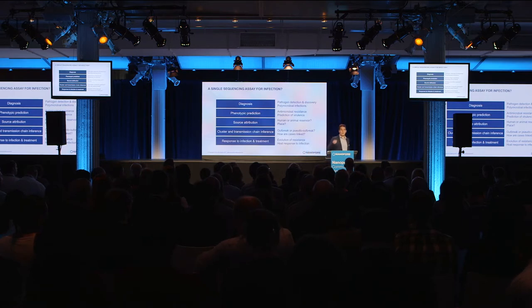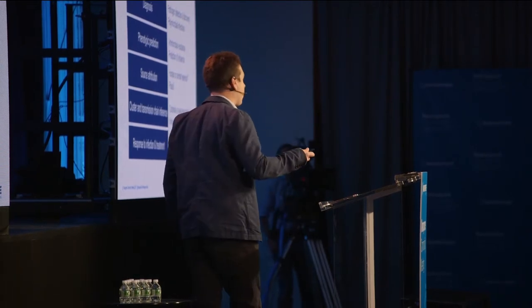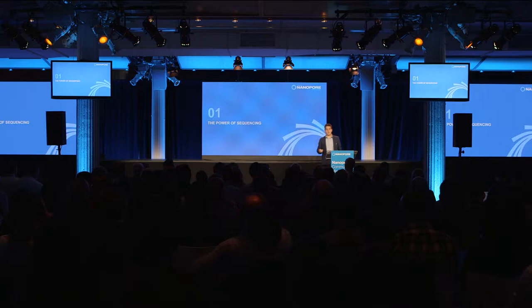And I really do believe that this is not that far away, the idea that we might be able to replace whole swathes of clinical microbiology testing with sequencing. And in the talk, I'm really going to talk about how far along that path we are and where the big gaps are that we need to address, whether that's in the lab or bioinformatically or socially.